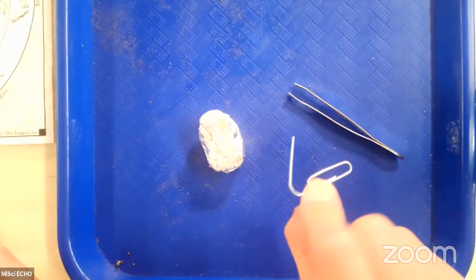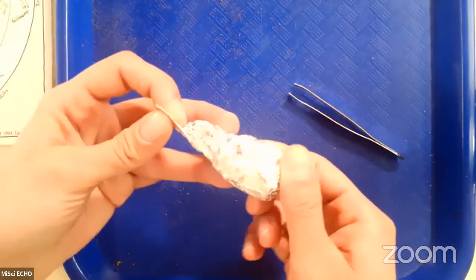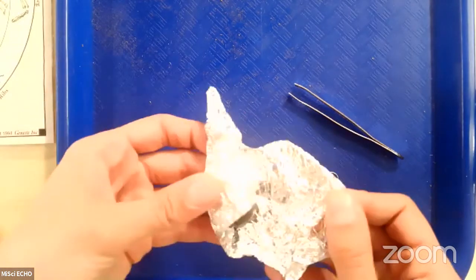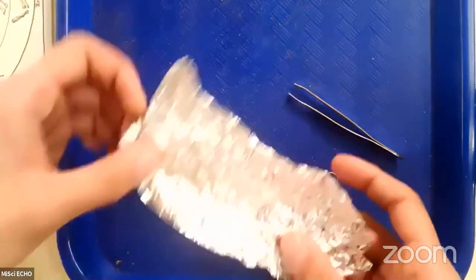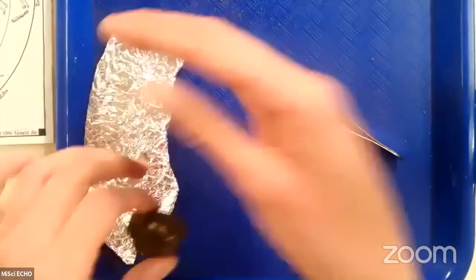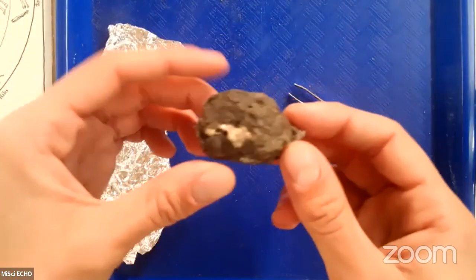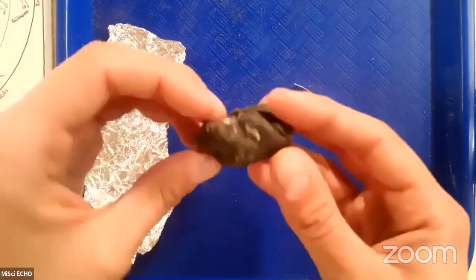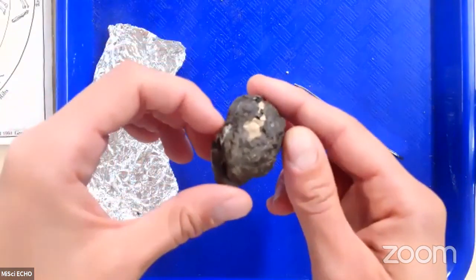But think about the tools that scientists would use if you've ever seen someone who is digging for a dinosaur fossil, right? This dissection is extremely delicate. We need to be very, very careful with our owl pellet because the bones inside are very small and very, very breakable. So we'll just set our tinfoil off to the side. And this is what an owl pellet looks like before we break into it. So remember that this is not poop. This owl pellet is a regurgitated piece of remains of the organisms that the owl ate.